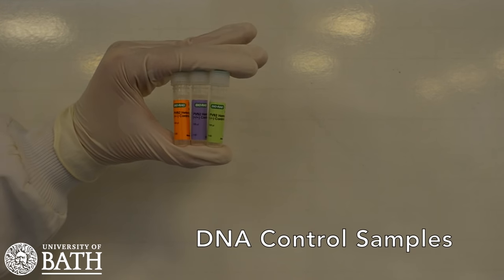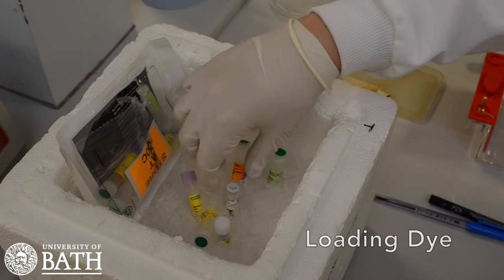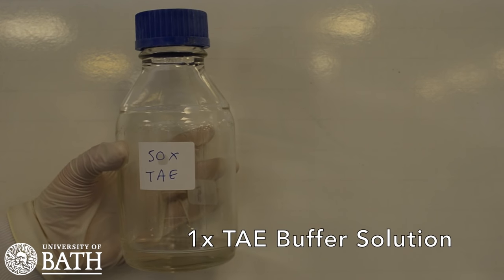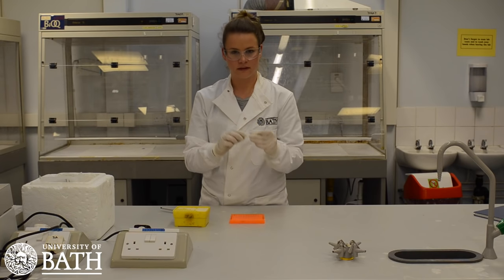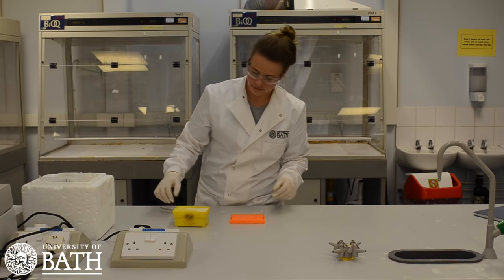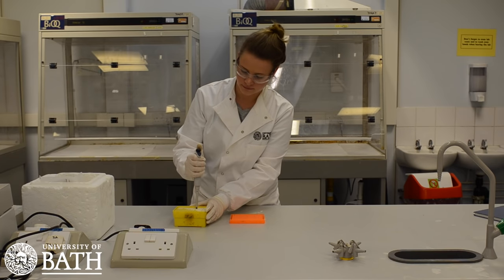For this lesson, you will need PV92 homozygous and heterozygous control samples, DNA loading dye, and TAE solution. Note that in your experiment, the TAE solution will have been pre-prepared at a 1x concentration. Begin with the PCR sample prepared in lesson 2, which has now been through the PCR process resulting in multiple copies of your original DNA sample fragment.